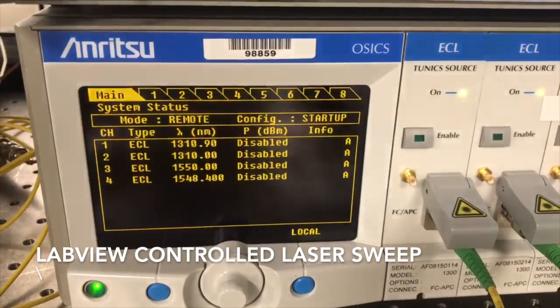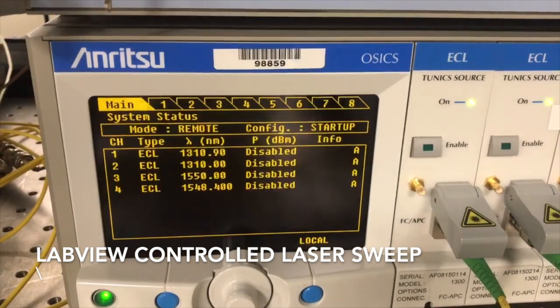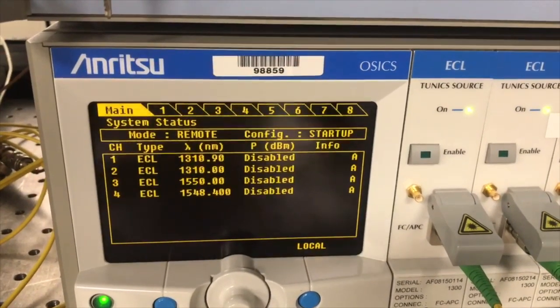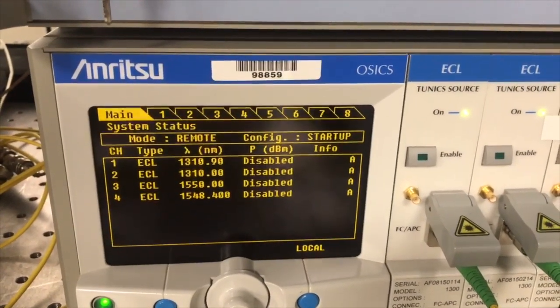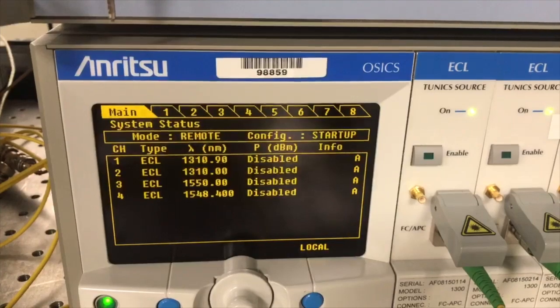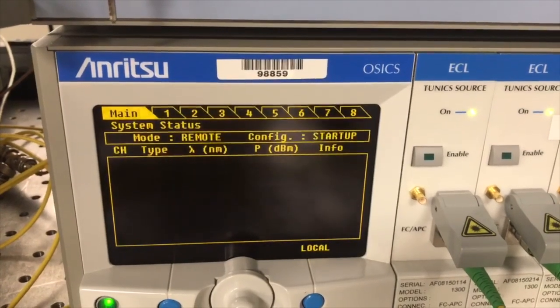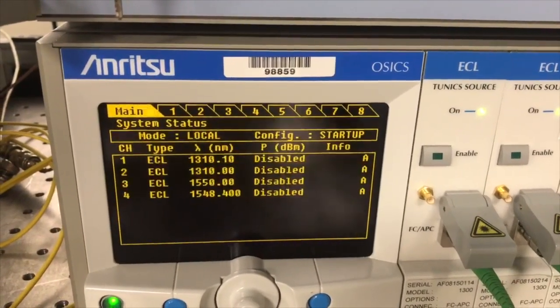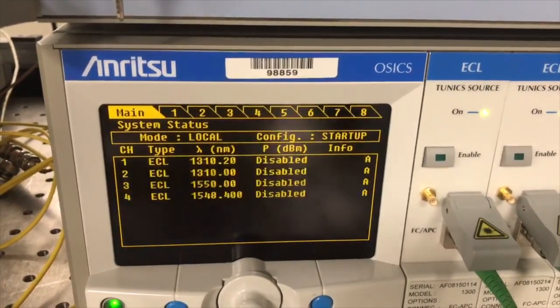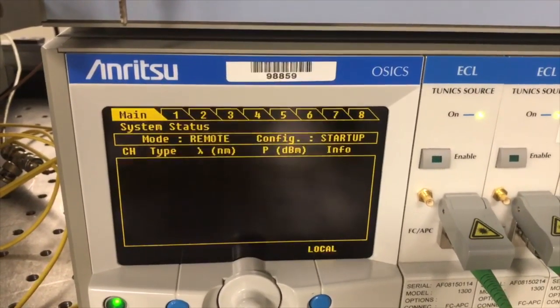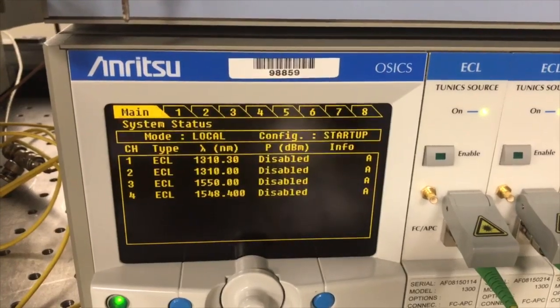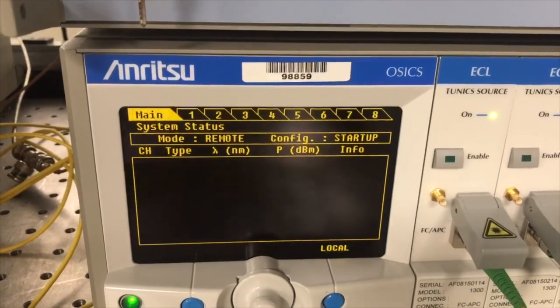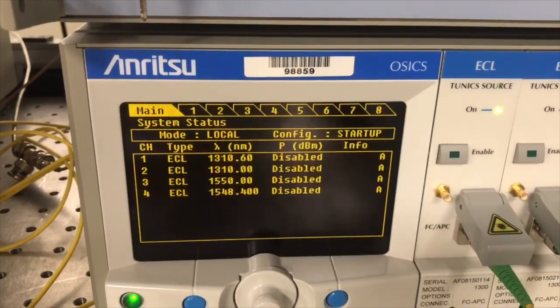Commencing test number one of the frequency update LabVIEW program. As you notice, channel number one is updated by 0.1 nanometers per iteration.